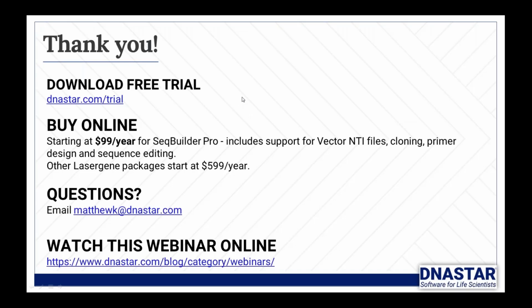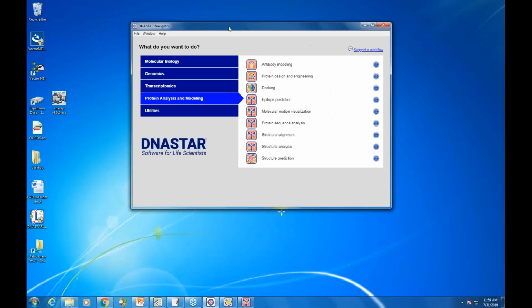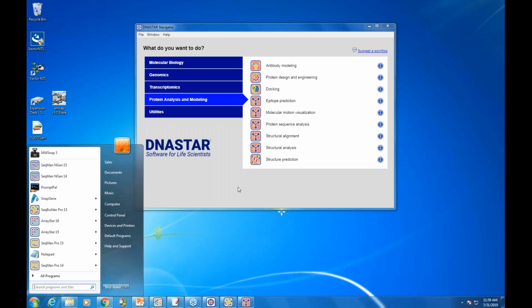The navigator really has been tailored for new users, where you might not know which application to launch for specific functionality. Once you're familiar with the workflows that you have, then the start menu is probably the best place to go. If we get enough feedback from our users that they would just like to switch the navigator over to a list of applications, that's something that we could add back at some point in the future.